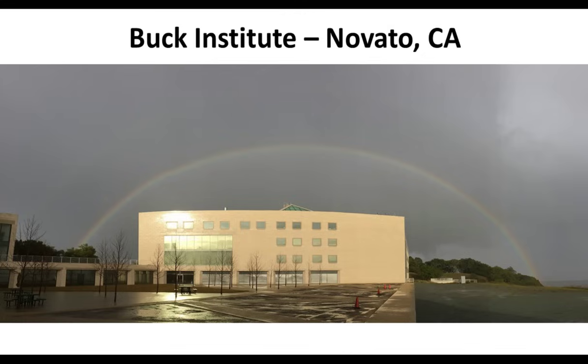Oh, yeah, sure. I do think it is very interesting having these developments, and particularly taking advantage of the specificity of these antibodies and applying them to a biological project, maybe having a hypothesis, having some evidence that the PTM space here changes. Having this combination of a smart workflow and sample preparation that's highly reproducible with an interesting biological question, and then, as I mentioned, the appropriate mass spec scan type, I think that really can help the biology collaborator get the most out of their precious biological material and gain biological insights, which is the ultimate goal of the experiment.